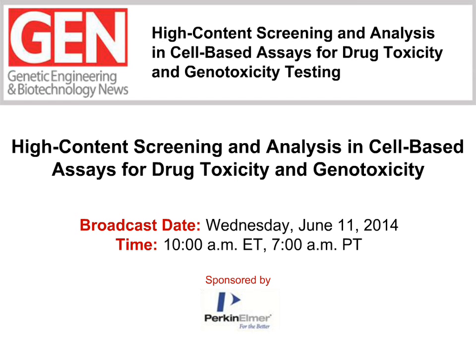If you're looking for insights into and best practices around high-content analysis and high-content screening and toxicity testing, you're in the right place. In this webinar entitled High-Content Screening and Analysis in Cell-Based Assays for Drug Toxicity and Genotoxicity Testing, our two speakers, seasoned HCA/HCS experts, will present two different approaches to using HCA to detect potential toxicities from cell models.